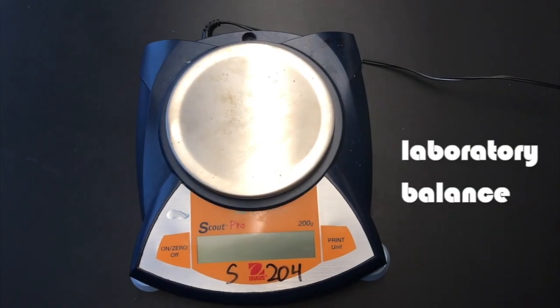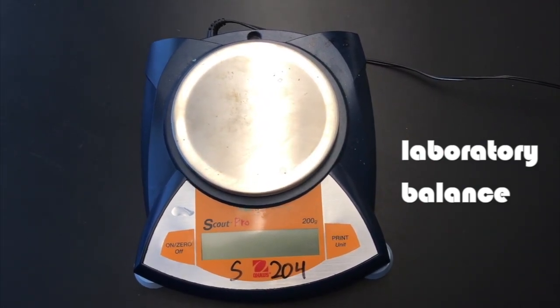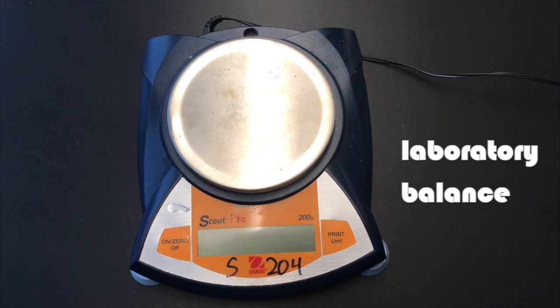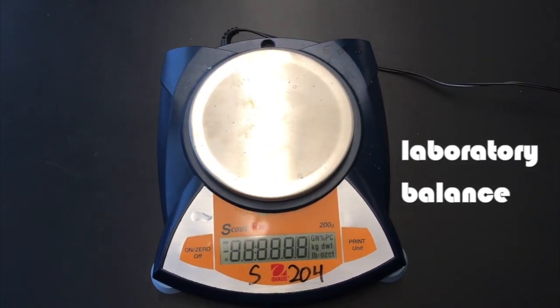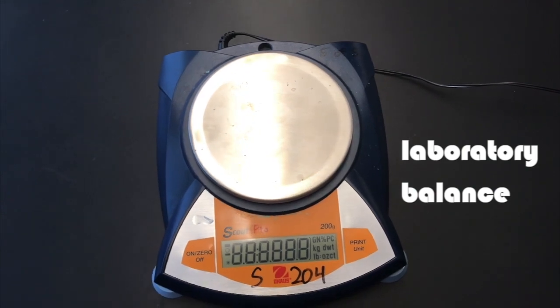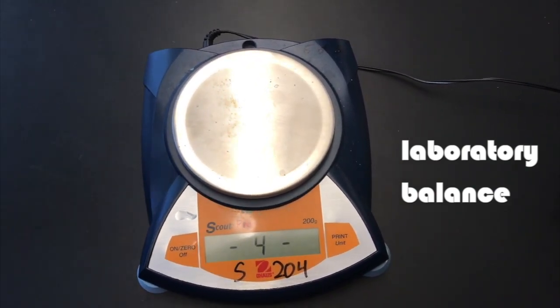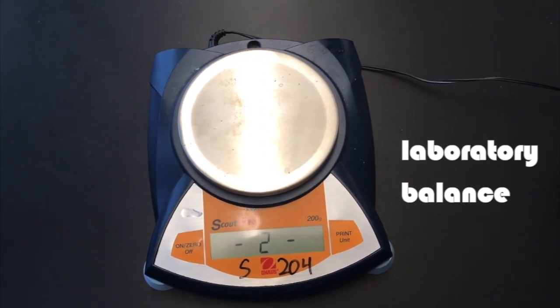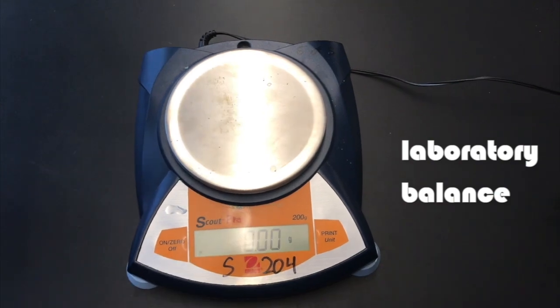The laboratory balance is a sensitive piece of equipment and should be treated accordingly. Do not place extremely heavy objects on the laboratory balance. Turn on the balance by pressing the on/0/off button. Wait a few seconds. After the 3 zeros appear, the balance is ready to be used.